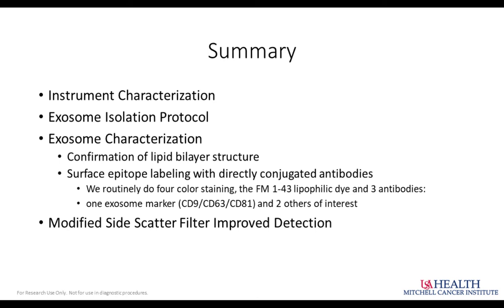Well, thank you. Looks like we have time for one more question. How did you determine the optimal titer of antibodies to use in this application? Really no different than titration of antibodies on cells. It's very important to try a variety of different concentrations.